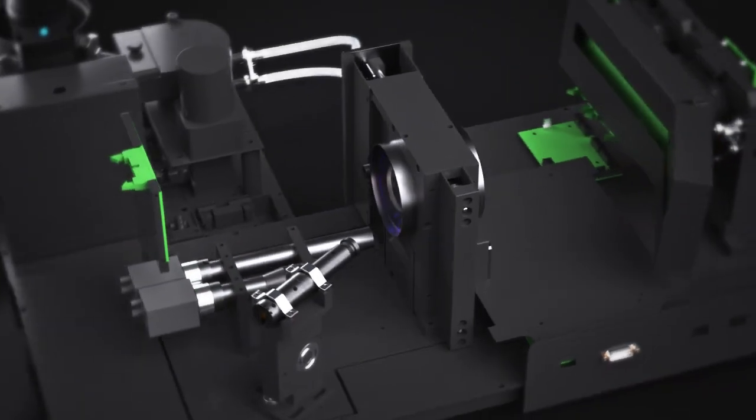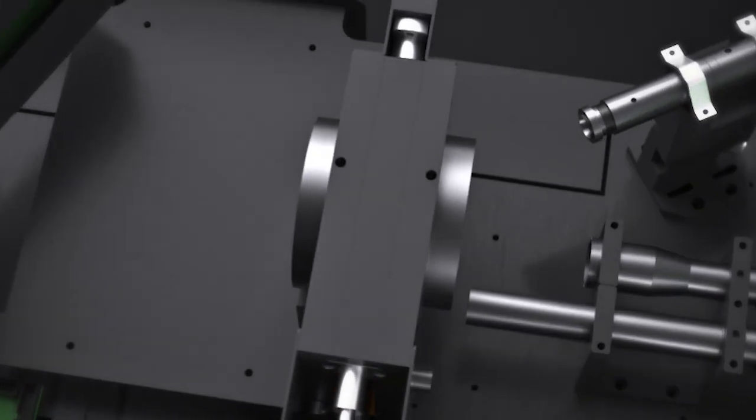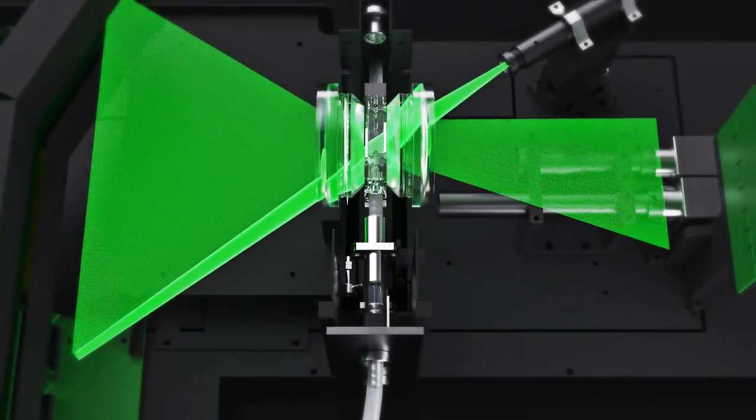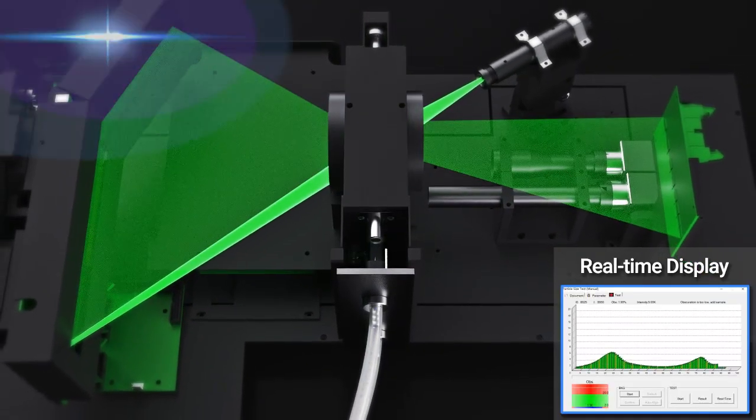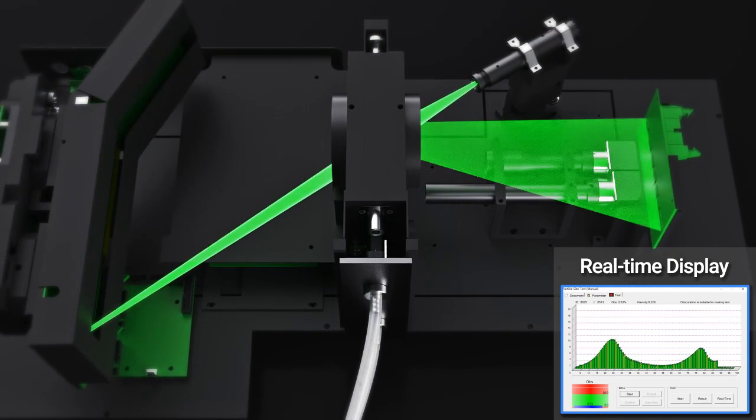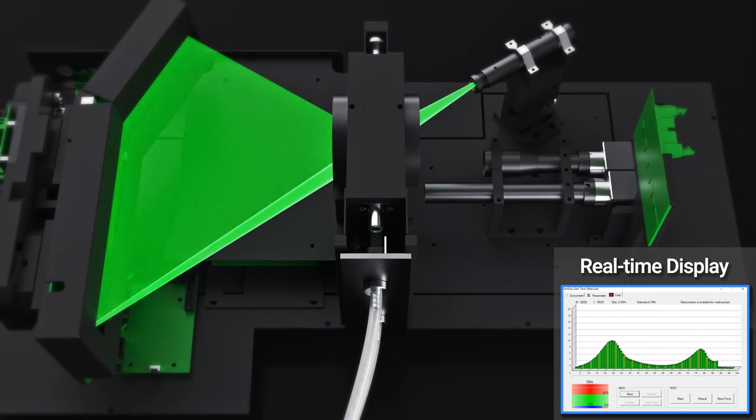Designed in oblique incident structure, it provides a continuous and consistent wavelength scattering spectrum. It also broadens the detection angle range up to 165 degrees. This makes sure that even nanoparticles can be characterized effectively.